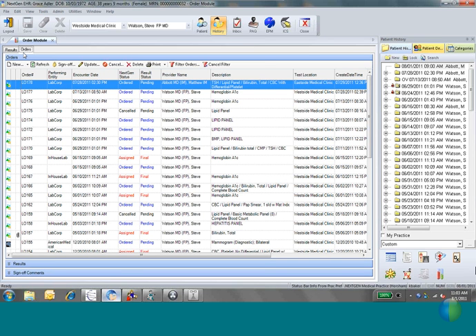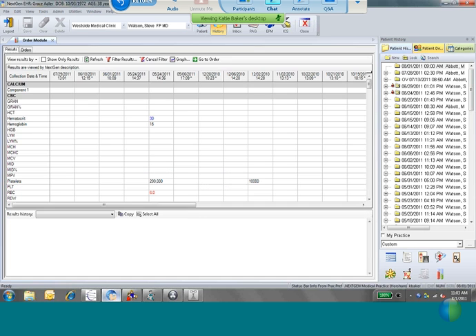the lab, if that's the type of interface that you have, or a radiology interface too. And so this information that you're seeing, these are all orders that have been placed for an individual patient over many, many different encounters. And so therefore, the orders module and the interfaces that you have are responsible or can be responsible for both orders and results.